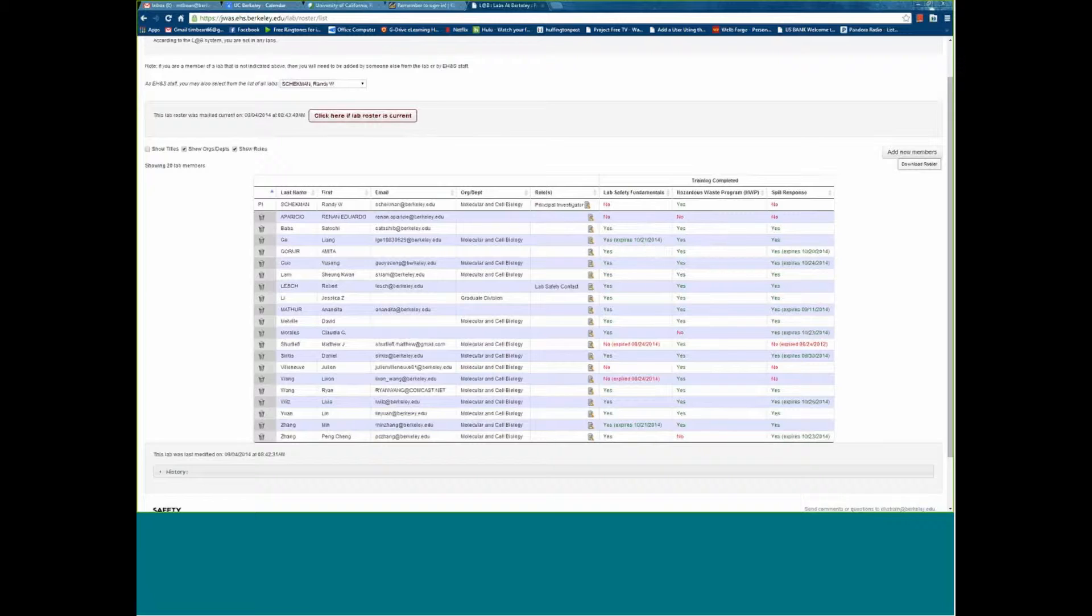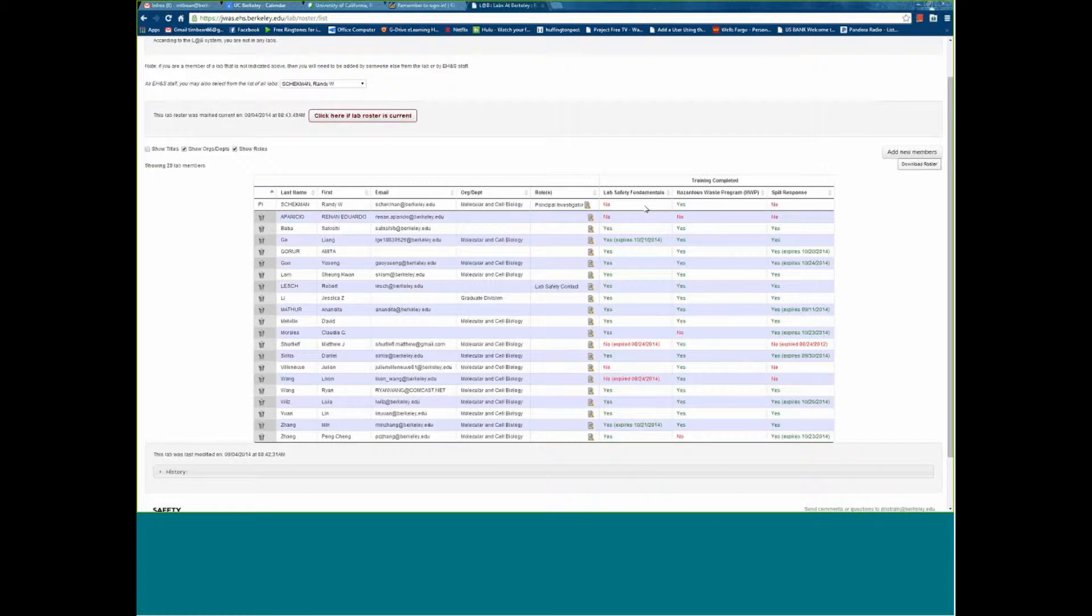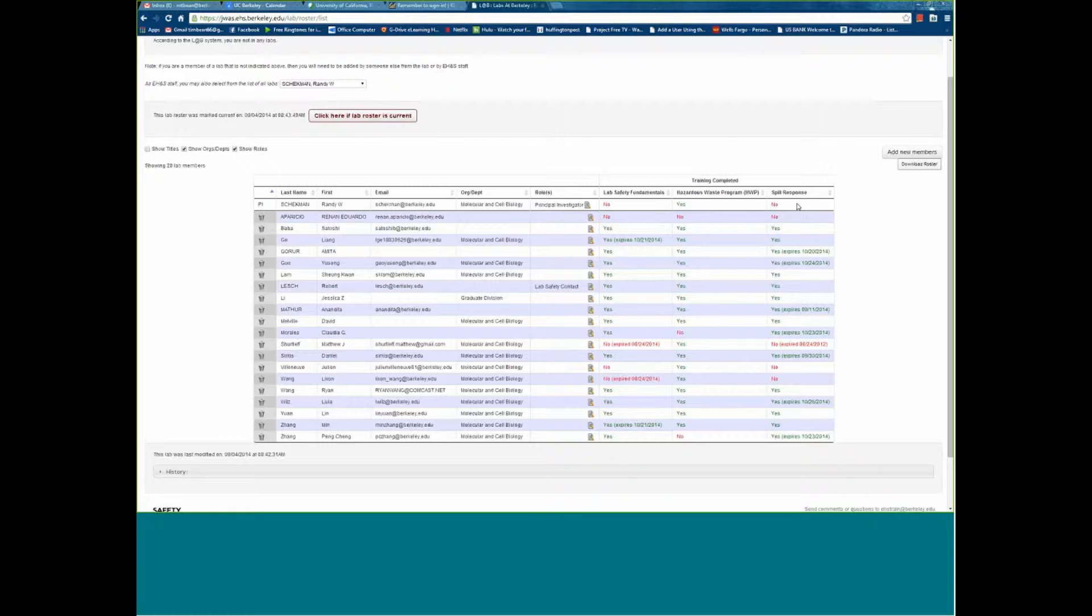These are the three courses that we require of all lab personnel: EHS 101 lab safety fundamentals, the hazardous waste program - a tool that allows a user to get the mandated training for hazardous waste handling and allows them to print out a label and call for pickups - and then we have our local CUPA, which requires hazardous materials spill response training and refresher every year.